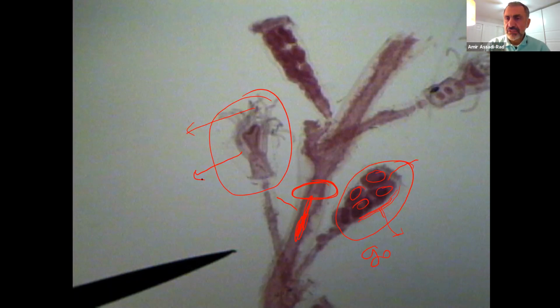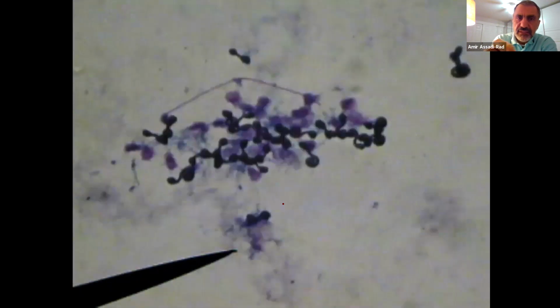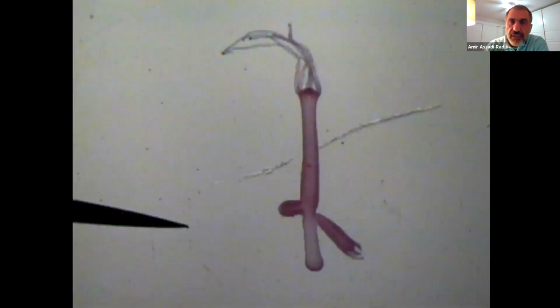Obelia, and this is a polyp stage. Class Hydrozoa, phylum Cnidaria. These are nematocysts. Of course, they digest away the cells, and all you can see is nematocysts. These are nematocysts, that's what these are. Hydra, class Hydrozoa, tentacles. The mouth opening right here is a mouth. These are budding. And this is what they call foot or basal disc, either one.